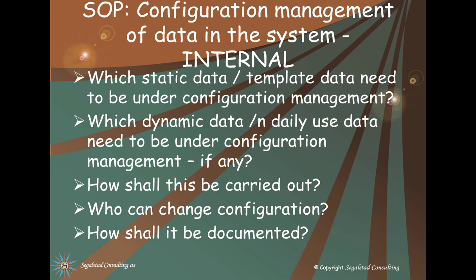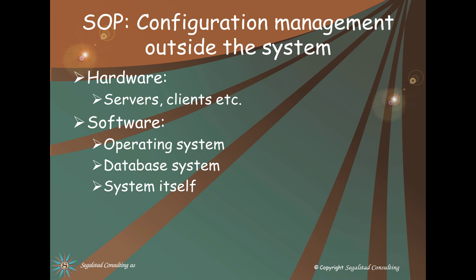We also need an SOP for configuration management. Now, those are a couple of different things of configuration management. One is the internal data in the system. Which static data or template data need to be under configuration management? Which dynamic data or daily use data need to be under configuration management, if we need to have any at all? How shall this be carried out? Who can change configuration? And how shall it be documented?